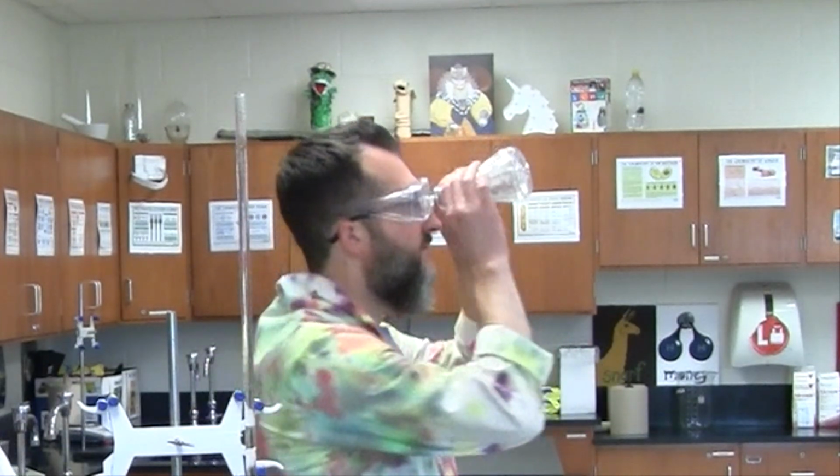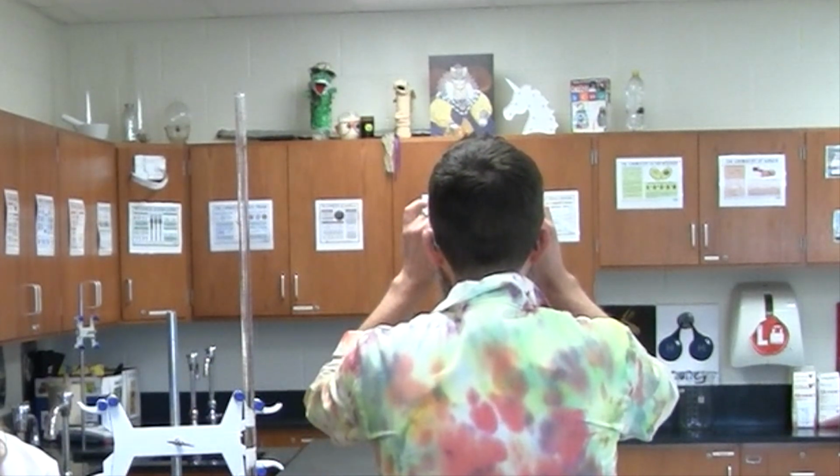Today's lab is acid-base titration. In this lab, we will be determining the unknown concentration of commercial vinegar. We will use a measured quantity of a base with a known concentration. For today's experiment, we'll be going right to period 2.